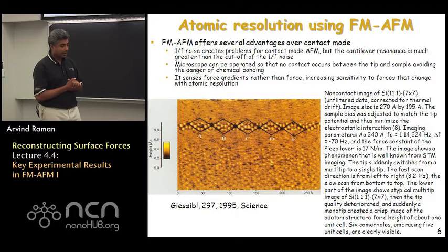One important benefit was the 1/f noise that exists in all AFM systems. By operating in the dynamic mode, one could operate at a frequency larger than the roll-off frequency of the 1/f noise. As a result, one could circumvent, or not be affected by, the 1/f noise.